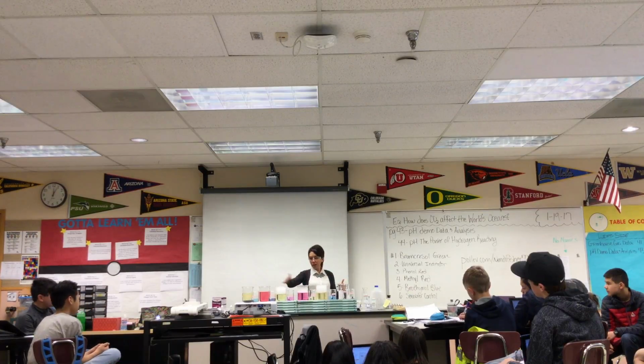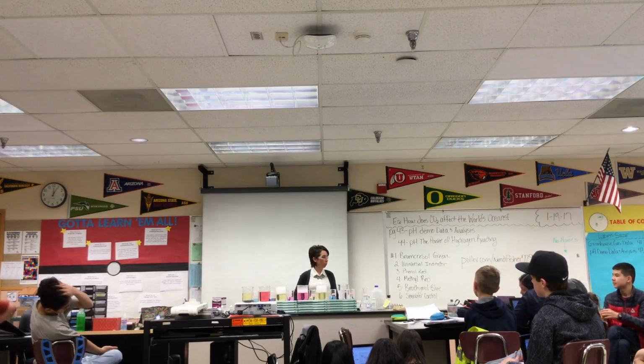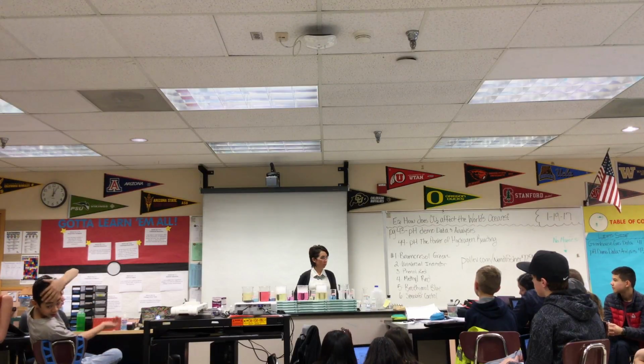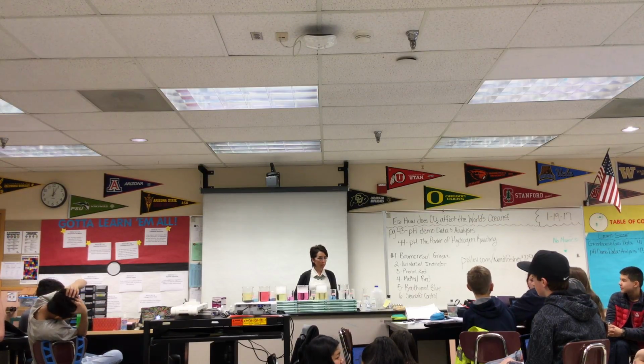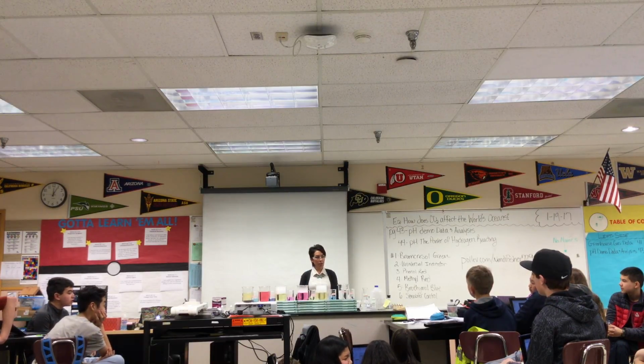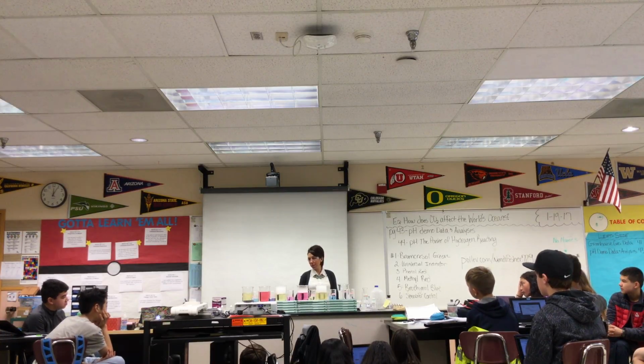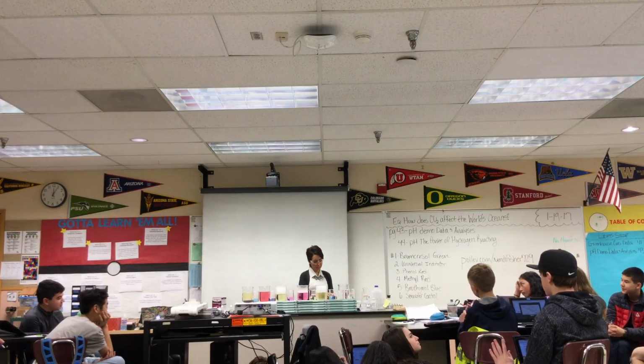Based on all of the other observations we just made, what do you think is going to happen to seawater when we throw in carbon dioxide? Lower the pH. Do you think there will be a color change? No, because there's no indicator in this.